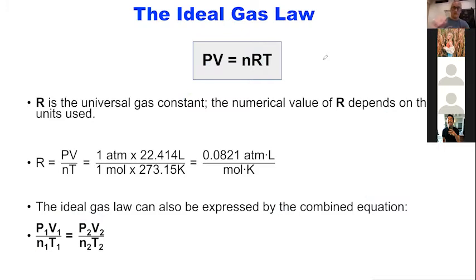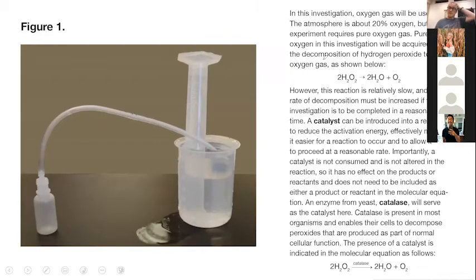So here's our setup. As I mentioned, we're going to make a bit of a mess tonight. So it's a good idea to put all of this stuff in a pie tin, which I brought down, or just have it on a towel or something that can hold water, because we're going to be splashing water around.